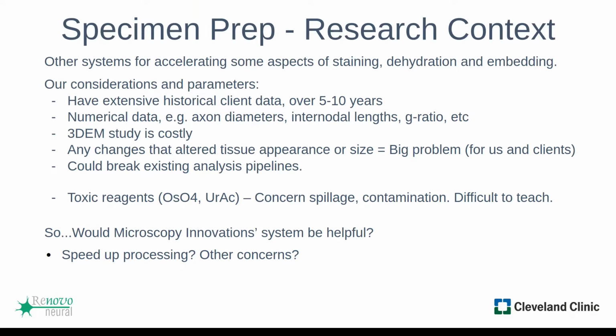So basically, if we had drastically changed any of our methods for a staining approach just to save some time, but it would render their previous data useless when compared to data analyzed after such a change, that would be basically awful for everyone, a huge waste of research dollars, and render the experiments unable to be completed.